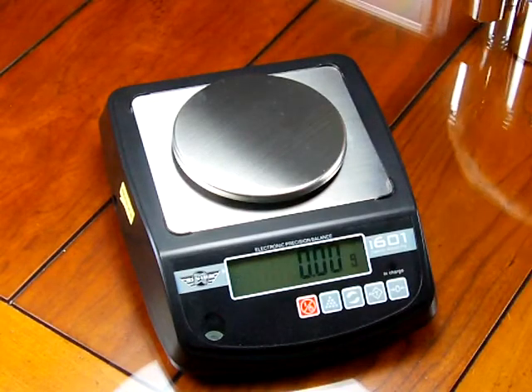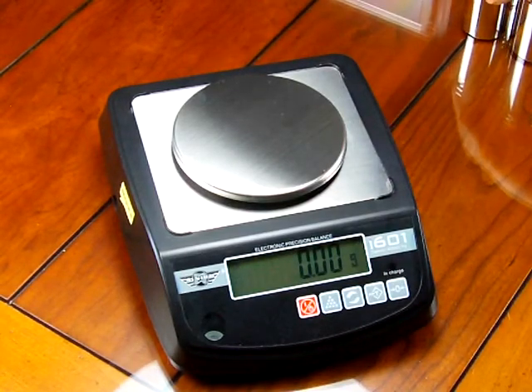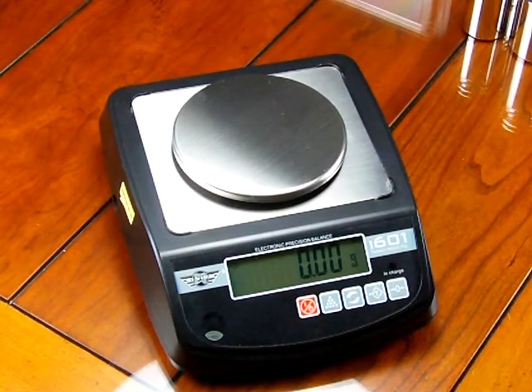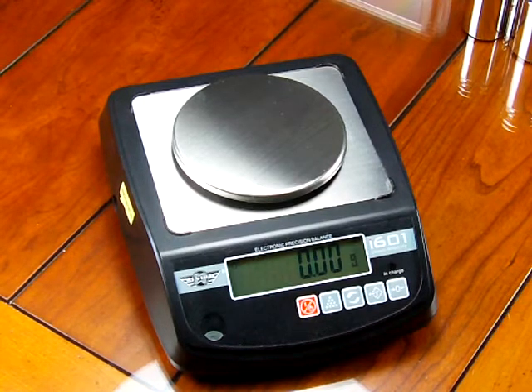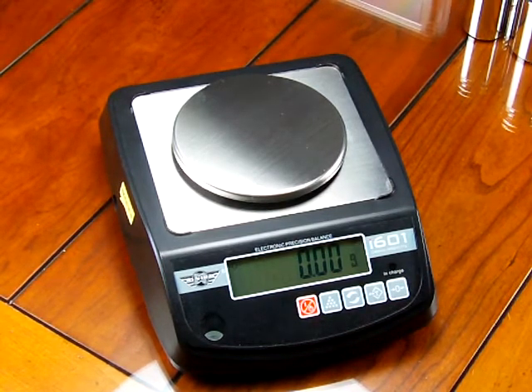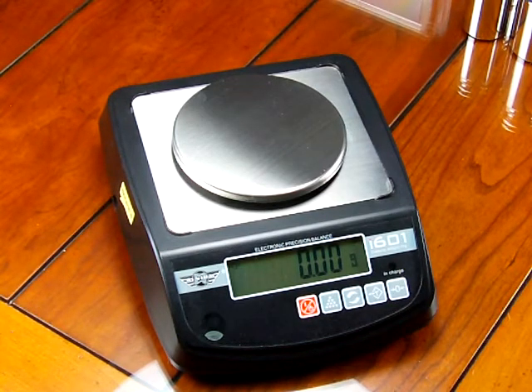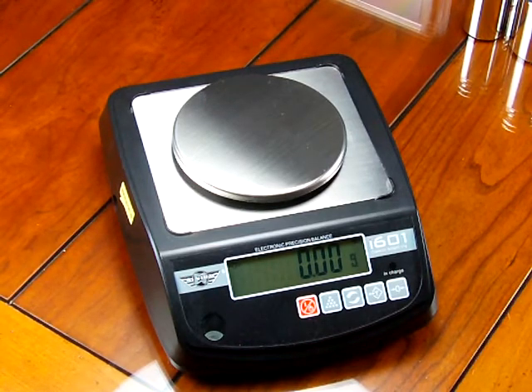So this is our demonstration of the MyWay i601. Again, we're an authorized MyWay dealer. We've been selling the MyWay line since MyWay began in their business. Visit us one more time at balances.com, where you'll find the i601 in stock and available for shipping.